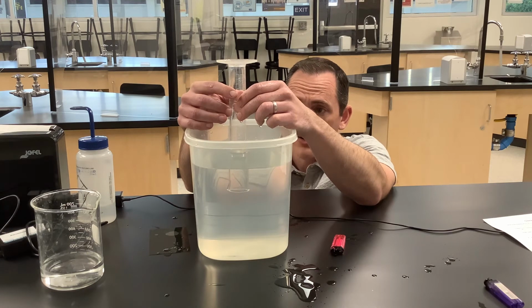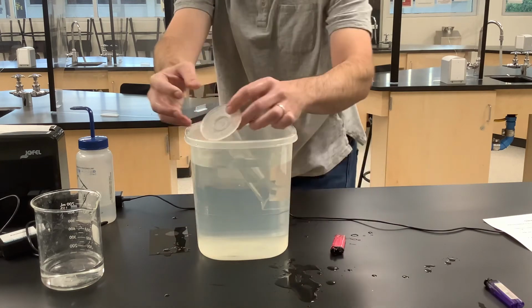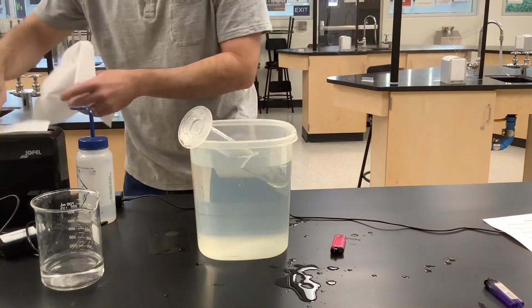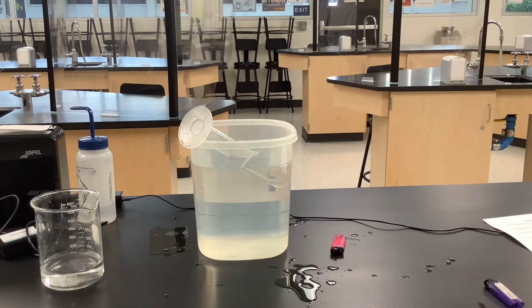Man, it's like right on 85. 1, 2, 3, 4. Yeah, I'd say let's go 85.0 on this. 85.0. So this is floating a little bit now, and that's okay. So record the 85.0 for the volume of gas collected. Milliliters.